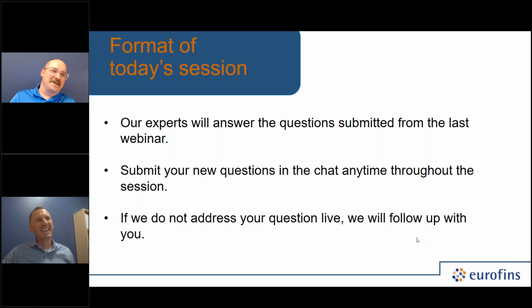This is really your opinion. Yeah, in my opinion, yeah. I think eventually, and I don't think it's going to be a short-term thing. I don't think it's going to be next year. Probably not even 5 years, but I think there's enough advantages, whether you're talking flow cytometry or digital PCR or something else perhaps that hasn't even been looked at yet, that eventually there's going to be a paradigm shift with the way that we're evaluating these materials, moving away from the plate count, and the traditional kind of, it's always been this way, it's the gold standard.